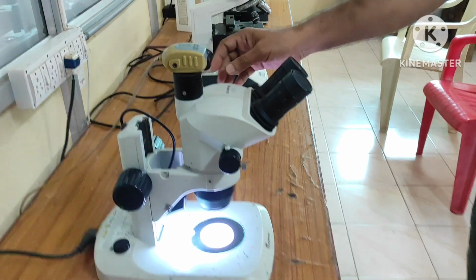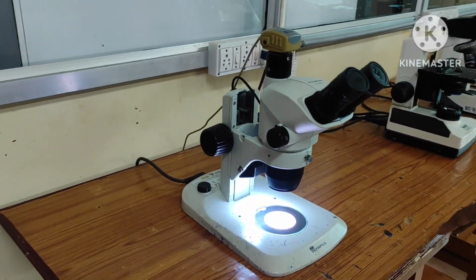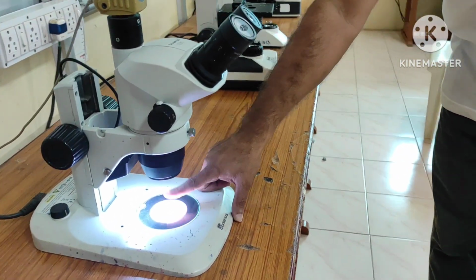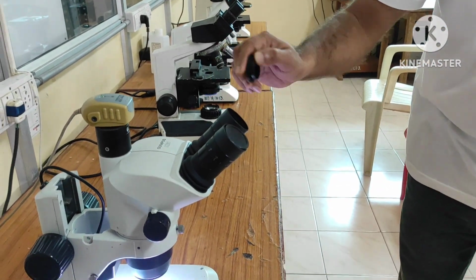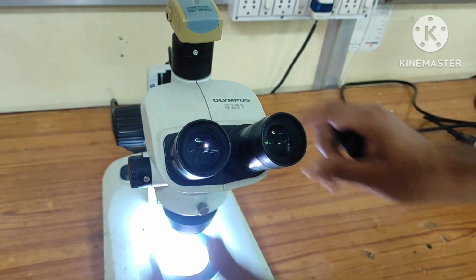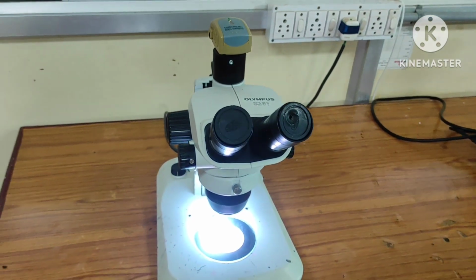Basically people who are working in the metallic field, metals, they used to observe through this. We used to observe somatic embryos and whatever things are present on the surface, a 3D view of that we can get by use of the stereo microscope. So a specimen we have to put here at this place, and then that image will be captured here, and we can observe that image through the eyepieces, right. We have to observe here only, right. Many adjustments are not there, but a good stereo microscope we have, that is made by Olympus basically. And I think this microscope is almost 15 years old, we are using it in our laboratory.